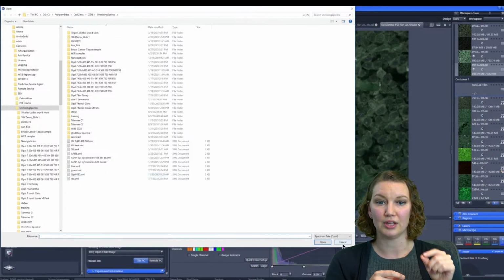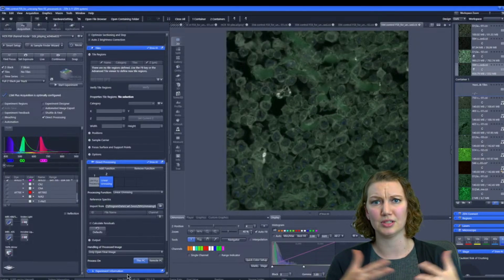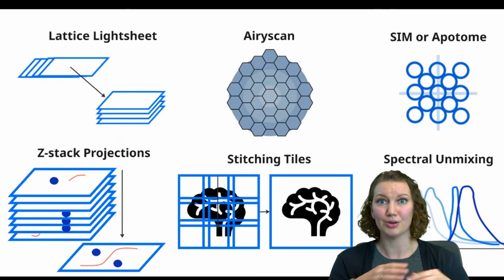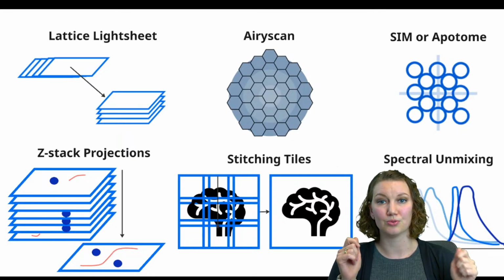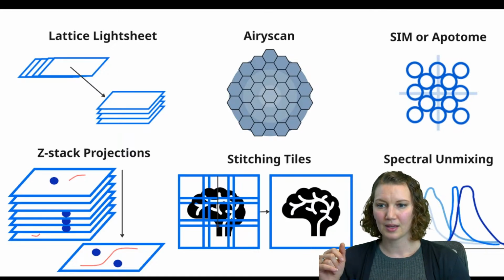But once you do that initial legwork, if you were doing this over and over again, it's really powerful, especially when you are looking at these multiplex samples with small puncta, and you don't want to lose any light. You want to be able to drop that laser down and separate all your channels as easily as possible. It's a really, really powerful workflow, but it can be done, again, in all these modalities and more.